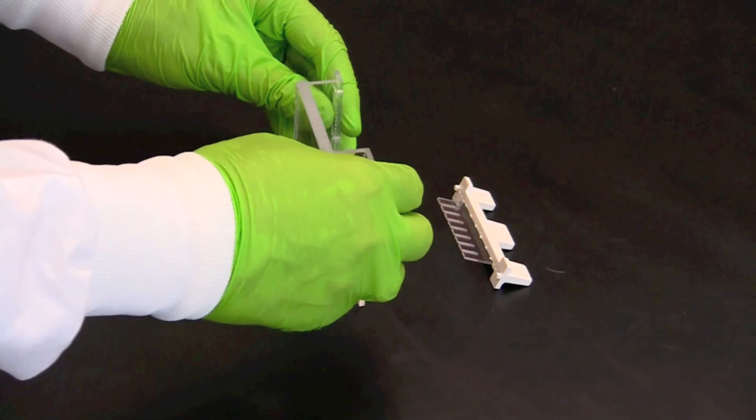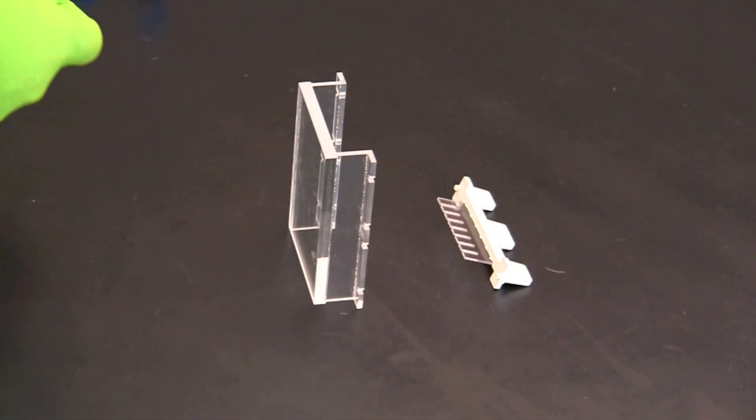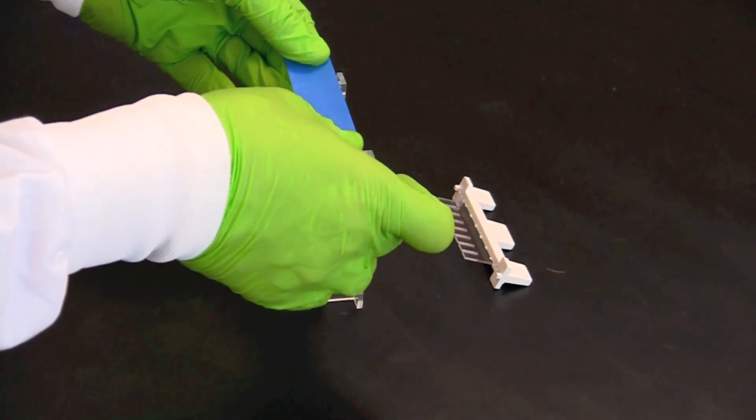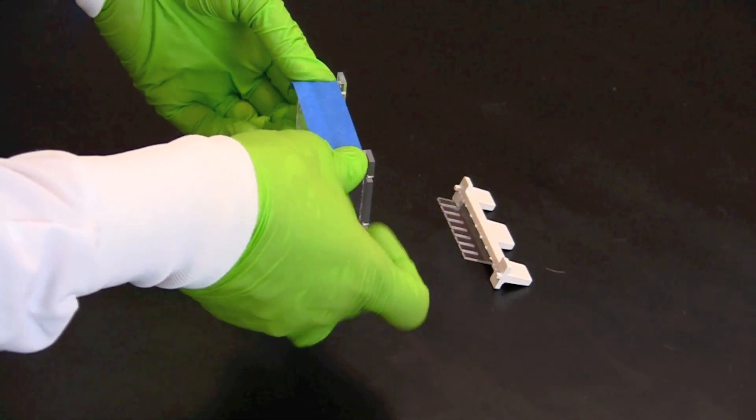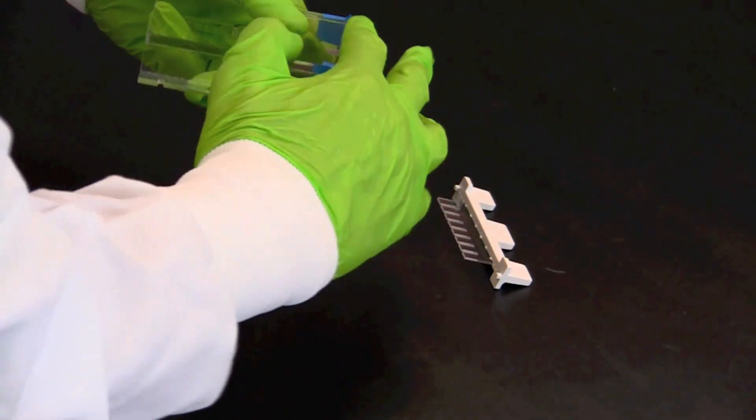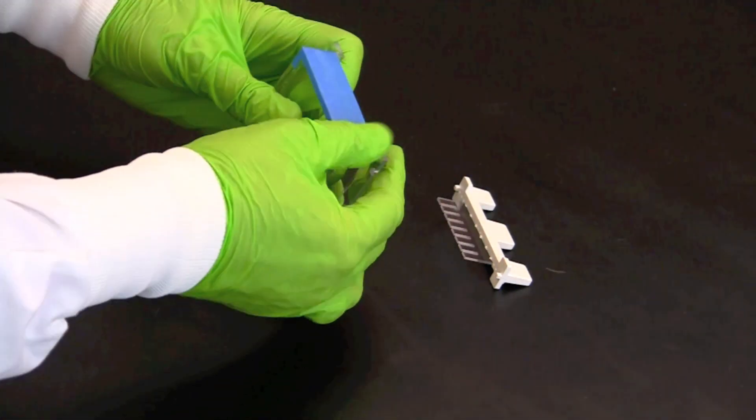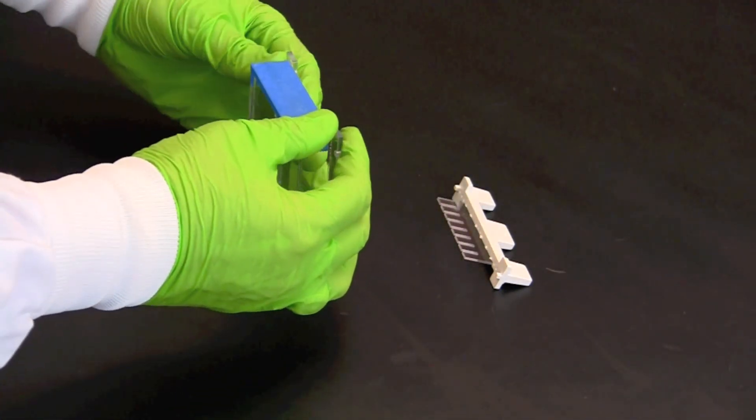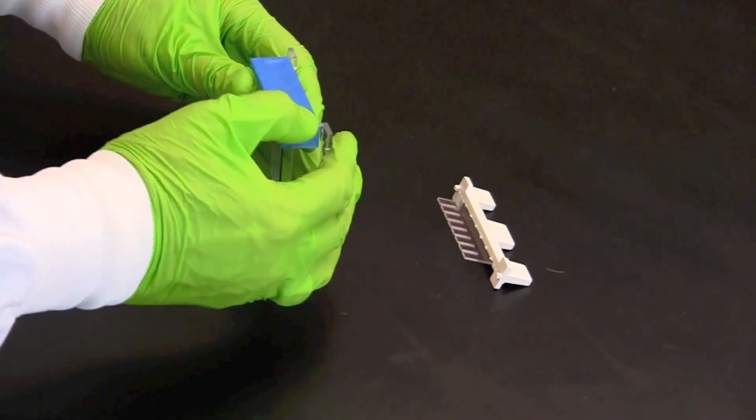Start by taping both ends of a gel tray with laboratory or painters tape, making sure to securely seal the edges of the tray. Press down firmly along each edge of the tape to ensure that there are no leaks.